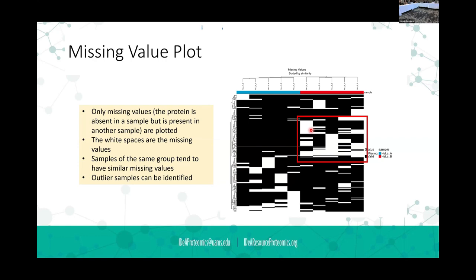95% of the time, we couldn't detect that protein in the cell lysate. And this was a few years ago, when we were probably detecting 4,000 proteins. And that wasn't one of them. It was one of the more abundant proteins. But it was so small in terms of protein molecular weight and so big because it's a surface protein, a proteoglycan, with lots of big sugars, that trypsin just didn't do a good job of cleaving it. And so we rarely, if ever, saw it. And the doctor just couldn't quite accept that as an answer. It was the answer, but he didn't like that.